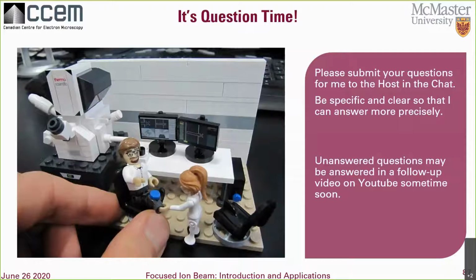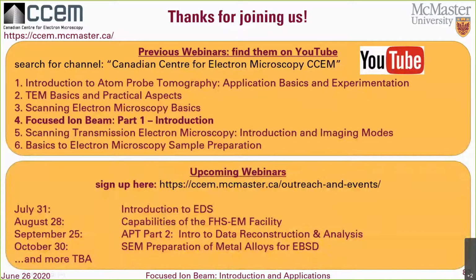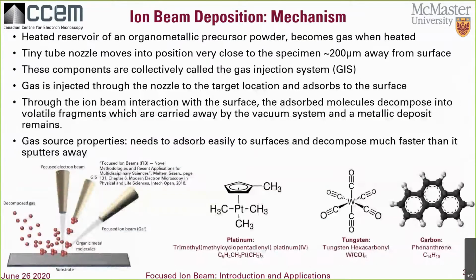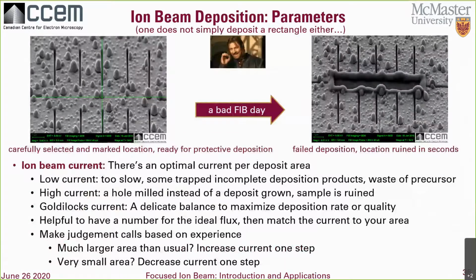Yeah, I went over this heavily in part 1, but there are a number of parameters. Actually, I can find that slide. Just give me a second. Right, here we go. Okay, so there's a lot of things to optimize for deposition. Things can go wrong.